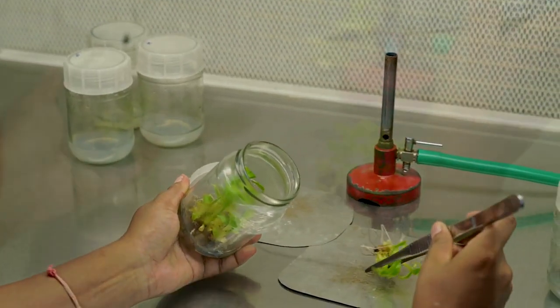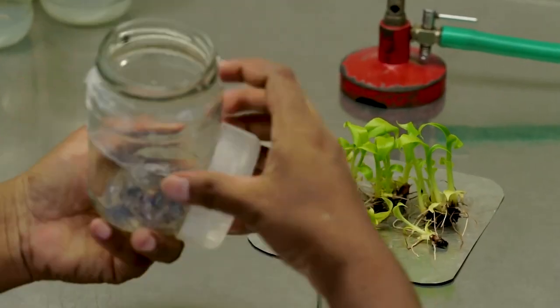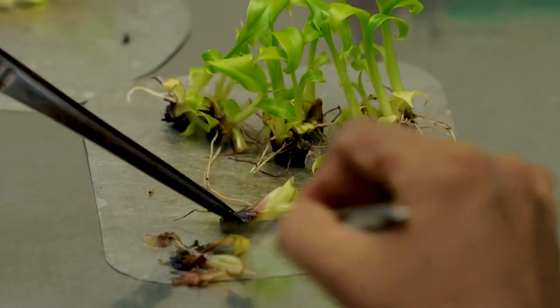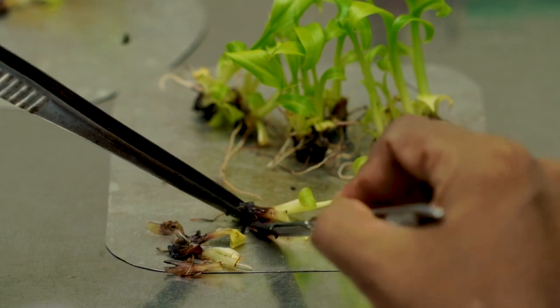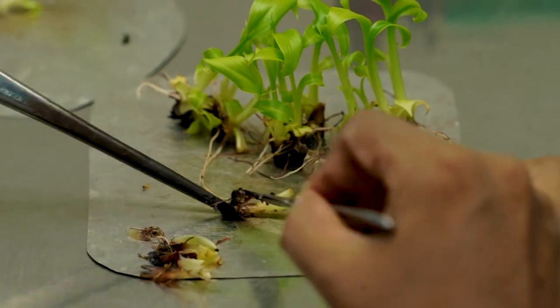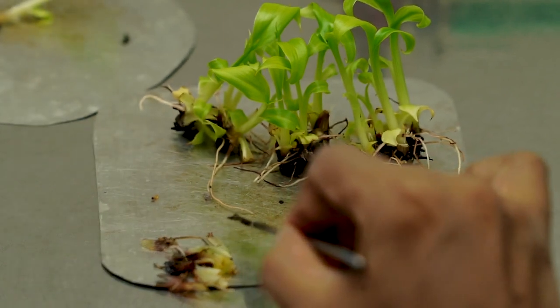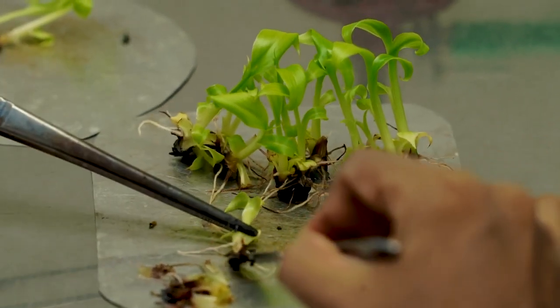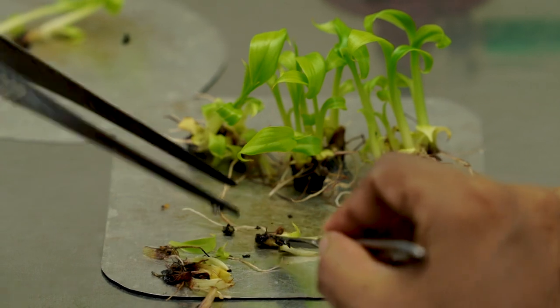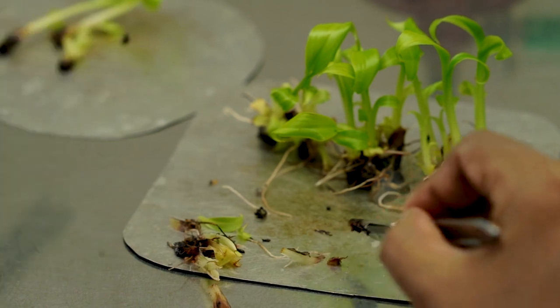After 3 to 4 subcultures, you will see growth and multiplication of the shoots. There will be regeneration in the shoots. This regeneration occurs because of the application of growth hormones in the nutrient media. The two most commonly used growth hormones are auxin and cytokinin. Cytokinin helps in proliferation of the shoots. Normally we use benzyl aminopurine, which helps in shoot proliferation or shoot multiplication.